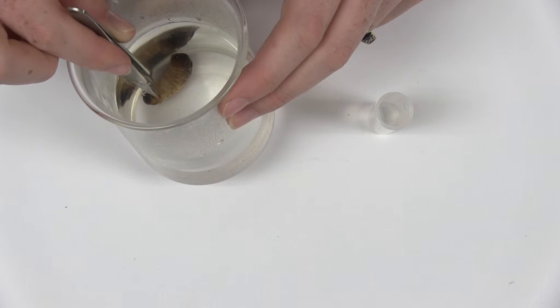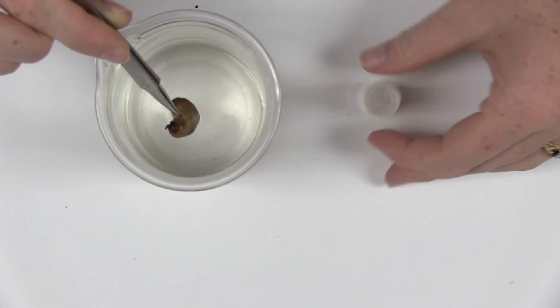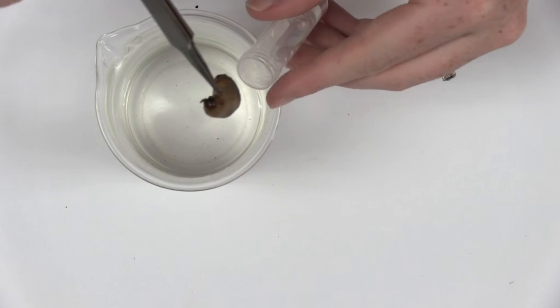When the grub is dead, transfer it from the water to the storage fluid. Gently use your forceps to place the grub in the tube without damaging it.